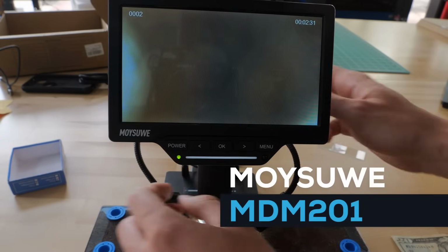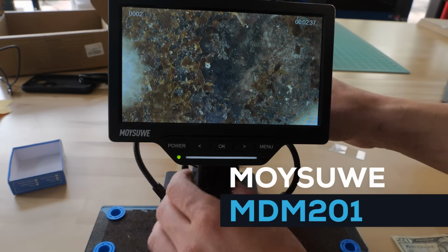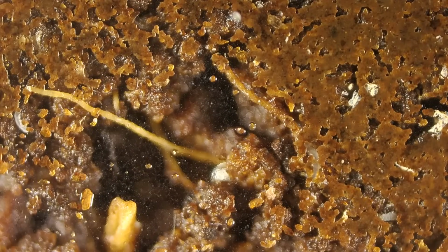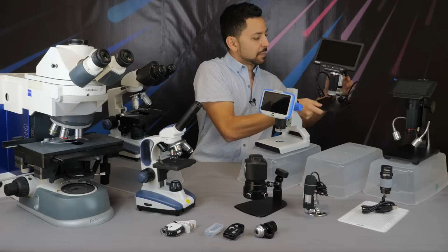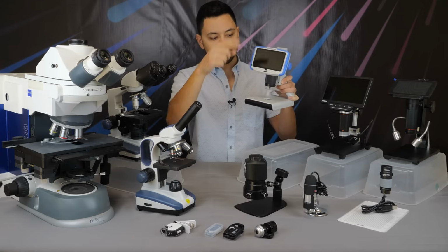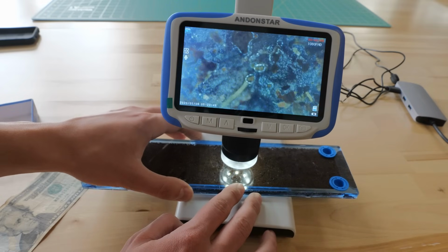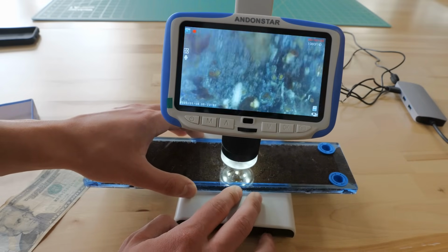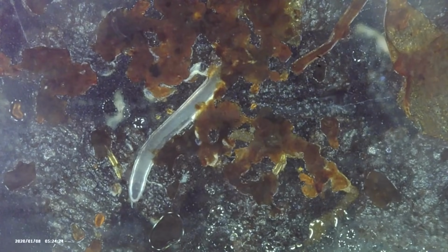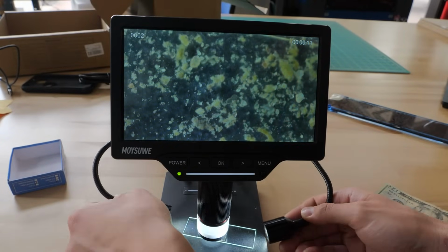That is extremely important if you're trying to look at any sort of sample that is reflective at all. That could be rocks, minerals, coins, even the Micro Safari itself, because it's acrylic on the top side, you're going to get glare. So for example, on this microscope here, the light either is coming up through the sample or there are little LEDs right next to the objective. And when that shines down onto a reflective sample, it's going to create glare and your image is not going to look very good at all. Whereas if you have gooseneck lights, you can adjust them to wherever you need them to be.